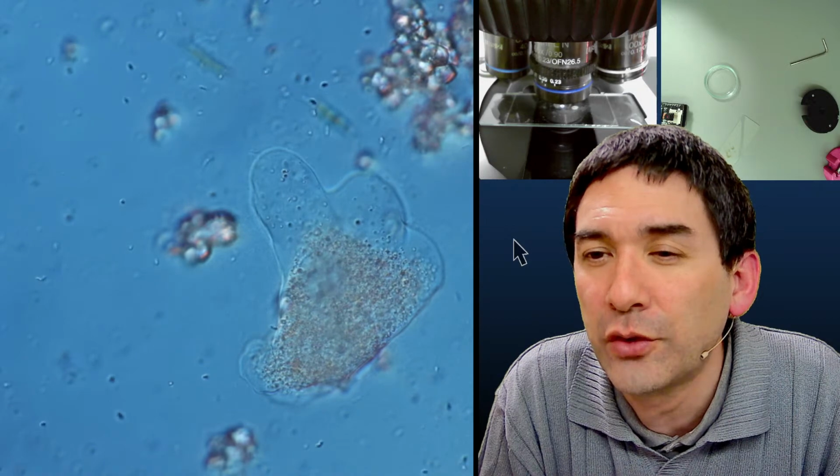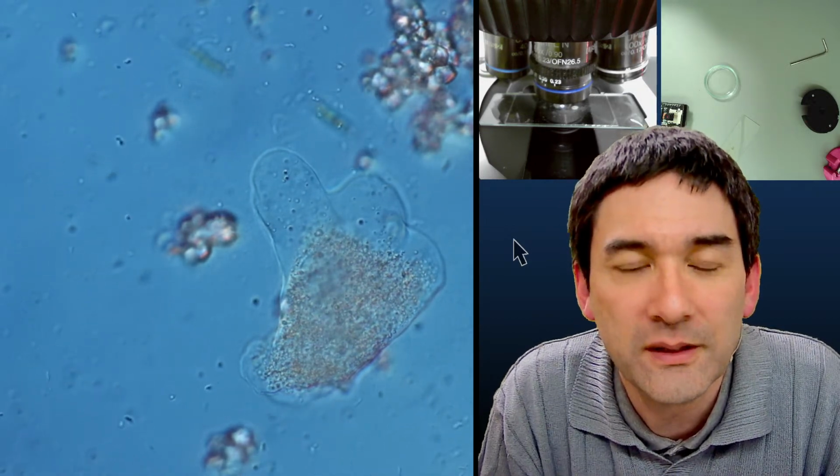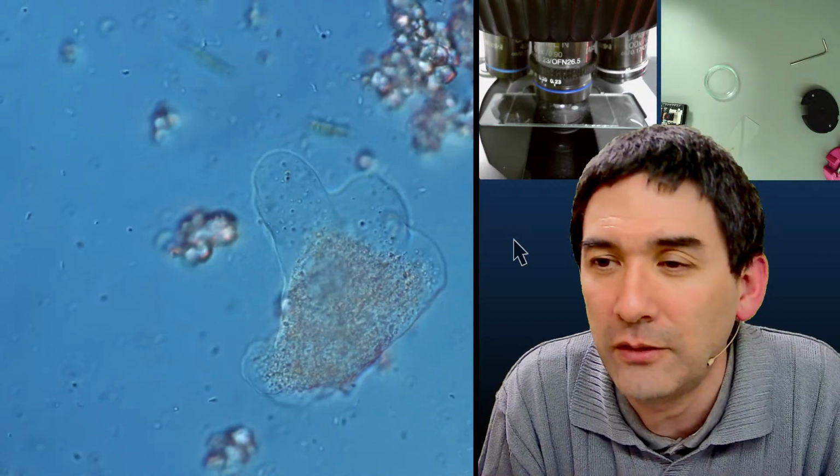Okay, great. Thanks for your response to my DIC questions. Okay, the amoeba is moving a bit. Yep, it's still not fully happy, but it's slowly regenerating.